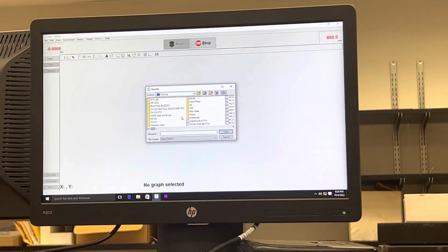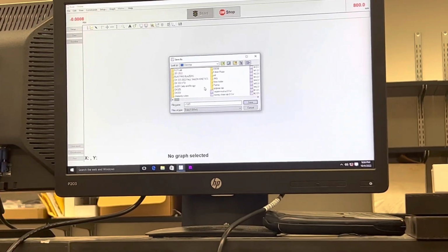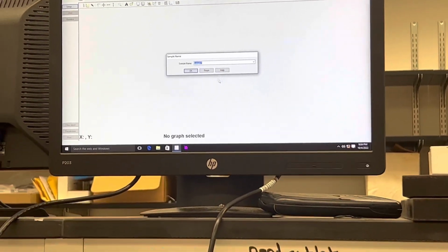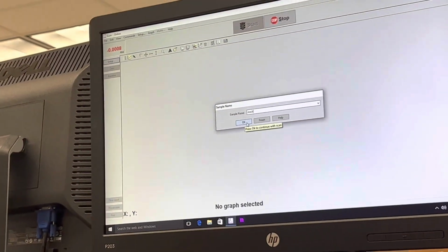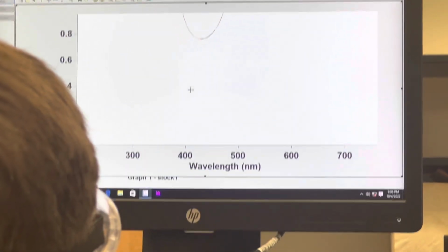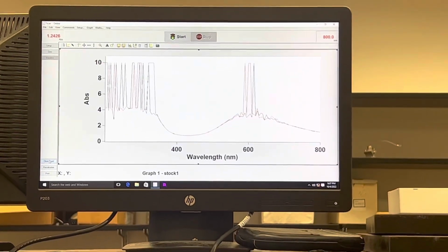Write down the name, file name. Write any name. Star. That's it. Right, do like... And then let's start too. Finish. Okay, good. You're just gonna clear the report.